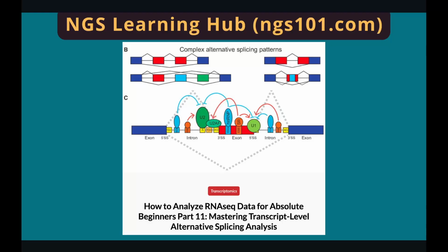And now you can go to my website, go to the corresponding tutorial, and copy the code and try them on your own. So far we have performed all the most major analyses for RNA-seq data. So in the next tutorial, I'm going to show you how to upload the analysis and the raw data to the NCBI GEO database for publication purposes.